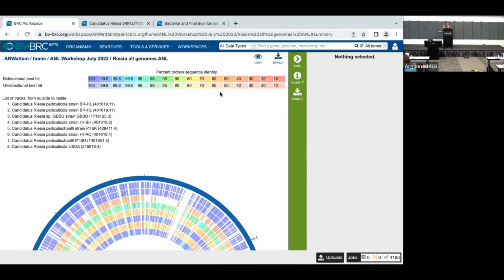However, when I'm doing things like with Brucella, I use those LPS genes, and those have tremendous impact for me and for other people who look at Brucella. Those are the first thing everybody looks at. So that's why I chose that. This is just to show you a picture of what it could be like with your data. So if you were studying a model organism in your lab, or a pathogen or organism of interest, you would just curate a list based on what you know about the biology of the organism.